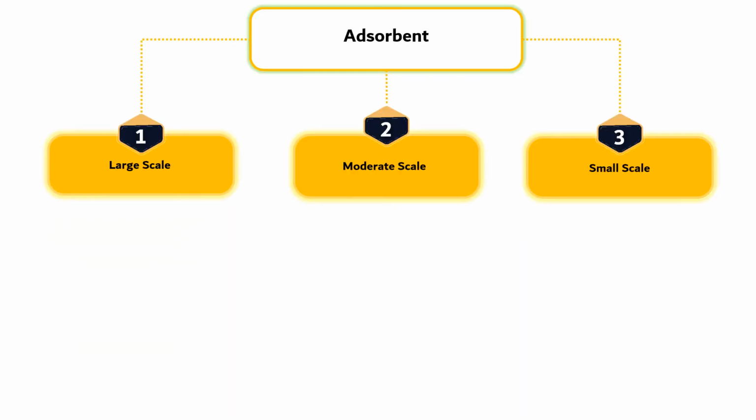Elution chromatography involves a pulse of solutes swept through a packed column by excess solvent. The packed column contains solid adsorbents which retard specific solutes and hence effect the separations. The solid packings commonly used for elution chromatography can be categorized as large, medium, and small scale.